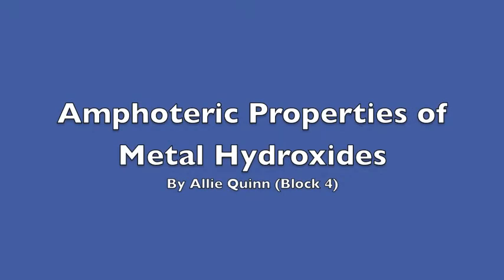This chemistry demo is all about the amphoteric properties of metal hydroxides. We will examine these amphoteric properties by observing what occurs when we combine zinc hydroxide, which is a metal hydroxide, with a basic solution and an acidic solution.